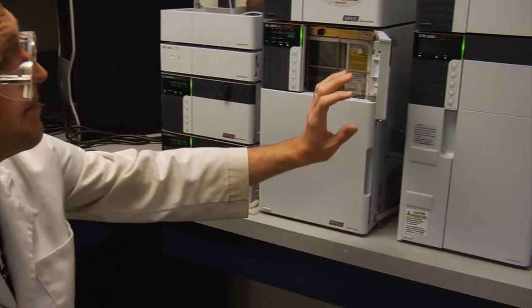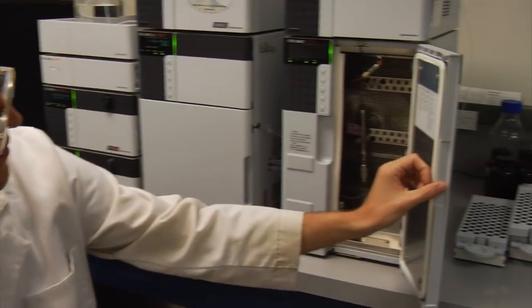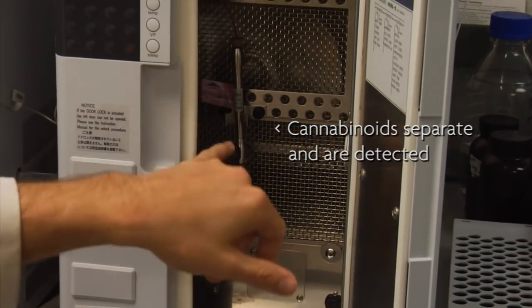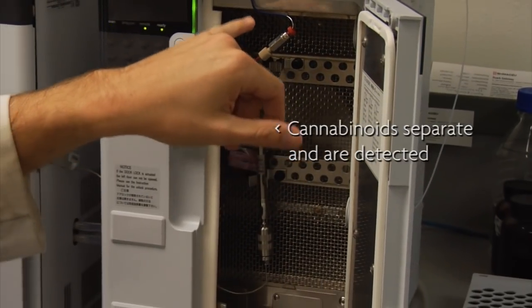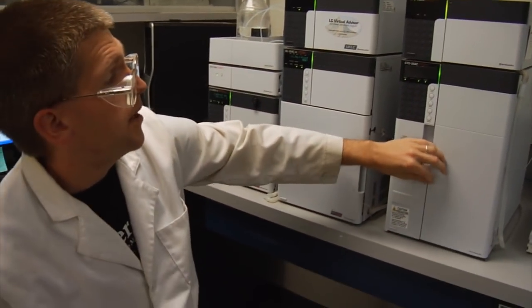The needle injects the sample into a liquid stream generated by these two pumps. The pumps then pump the sample into this column, where the different cannabinoids will separate and elute at different times at the back end of the column, and are then detected by the diode array detector that we use.